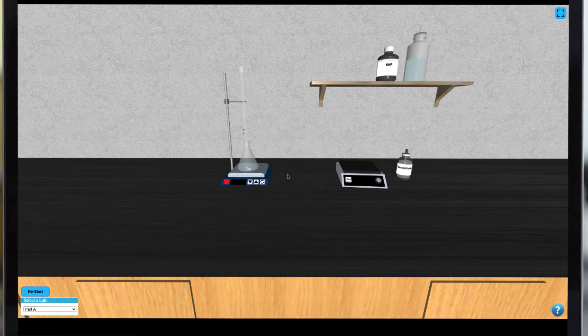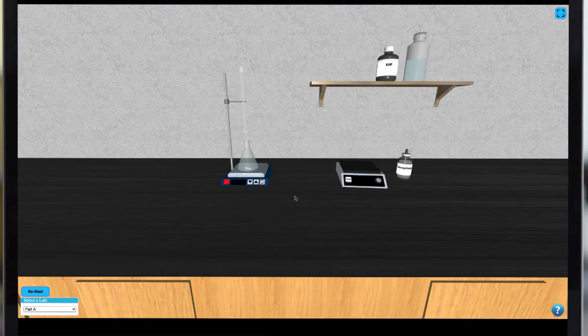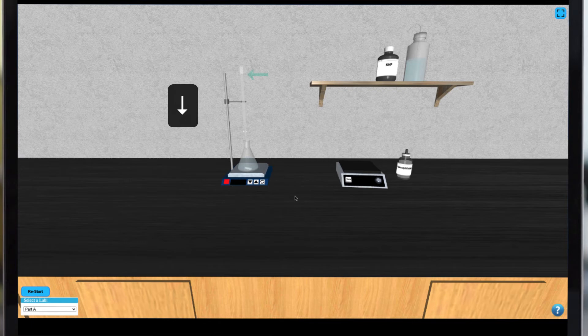You can dispense the solution from the burette by using your down arrow key. Note that the volume in the burette decreases and is added dropwise to your sample.